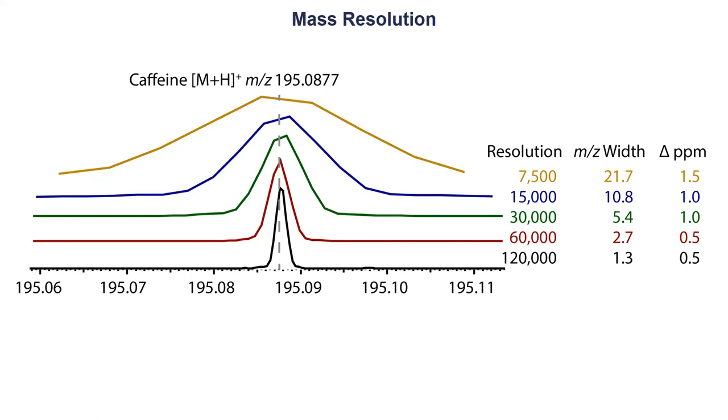But we see that we also have a shift in the ppm value. Of course, if we have a wider peak, it's harder to get to the highest point. And based on this, we get the shift in the end. But we see with the Orbitrap, at least, and it was freshly calibrated, the ppm is still 1.5, so it's not that bad. If you think about the resolution, if you set it higher, your scan rate is slower because you need more time to scan your ions. So this is also something you need to be aware of.